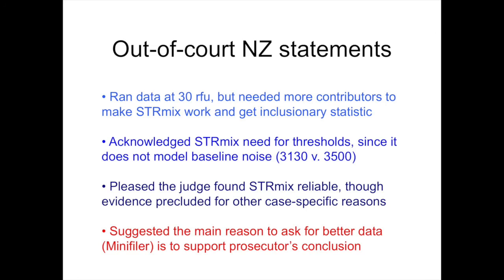This goes back to the philosophy that we saw in the workflow. The TrueAllele workflow, which is pretty standard in science, is you get your data, you put it into a computer, it objectively does whatever it's supposed to do, and when it's done, you get a number. And that number tells you to what extent somebody is present or absent. Big numbers mean someone's really in there. Very small numbers, 1 in a trillion, mean they're really not in there. And in between, you have less information.